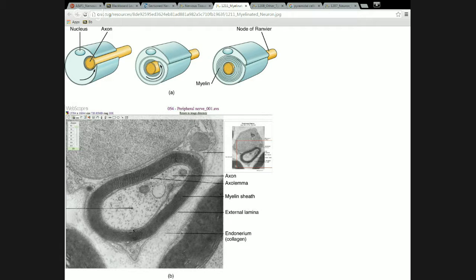The very thick dark line that we see surrounding this, that's the myelin around this axon. And then inside, the lighter interior, that's the axoplasm. All of the little dots that we see in there are proteins that are running the length of the axon, and they're picking up some of that lead stain because they're proteins. We can also see a little circle right there and a bigger circle right there. Those are vesicles that are traveling along the length of the axon.